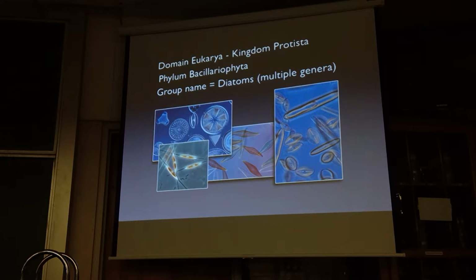They're always flat, like diatoms are flat, with two frustules, but the shape of these things is quite variable. The prepared slide that you will see for the exam has 12 types, and one of them looks like a Coke bottle. So they have a wide variety of shapes that these things come in, and different sizes, but remember that's because they do the shrinking division business.